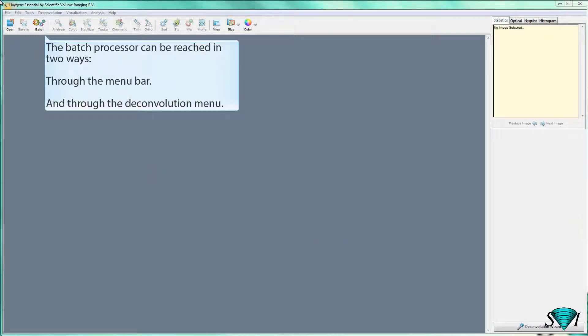The Batch Processor can be reached in two ways: through the menu bar and through the Deconvolution menu.